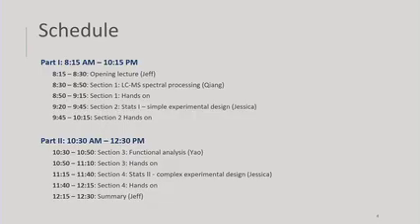And then following that is functional analysis. Functional analysis is how you go from compounds or peaks to actually get pathways and functions. We receive a lot of questions on this, and here we are going to introduce the concepts, the parameters, and then followed by your practice, okay?